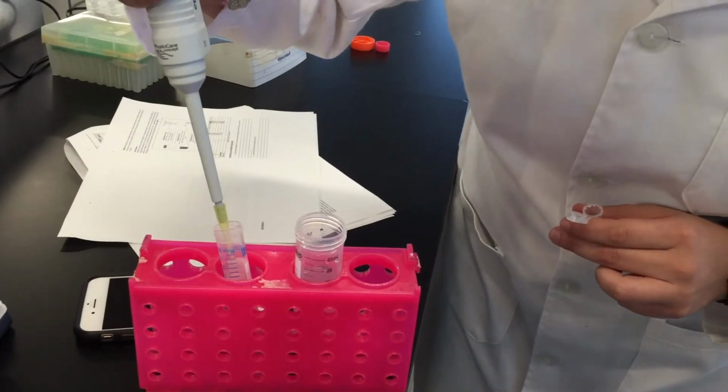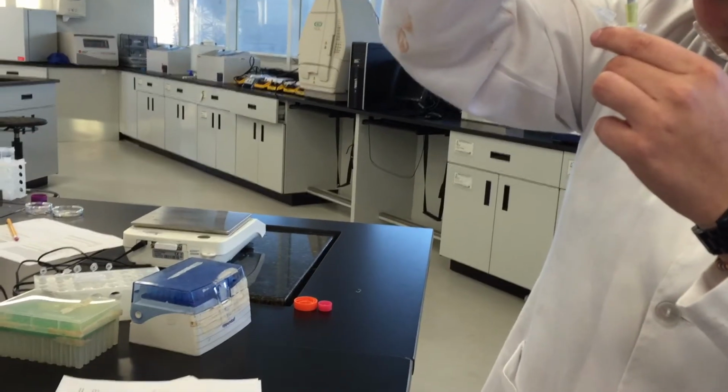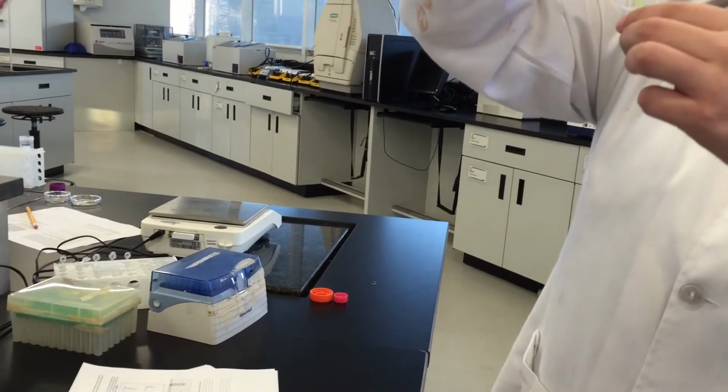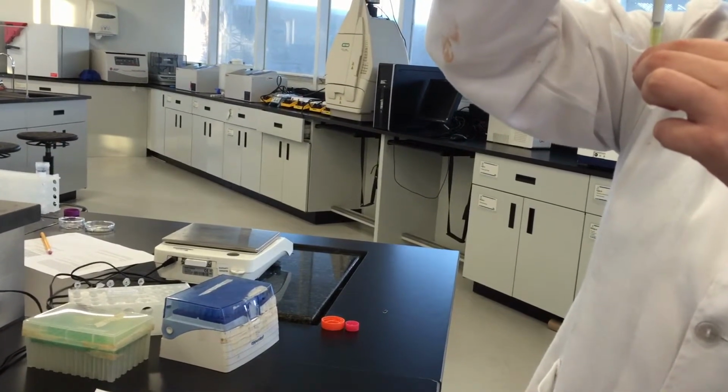Another activity is conducted in order to verify the pipetting technique, which was to make measurements by the parts that were deposited in a microtube, to finally recover the full amount of the liquid.